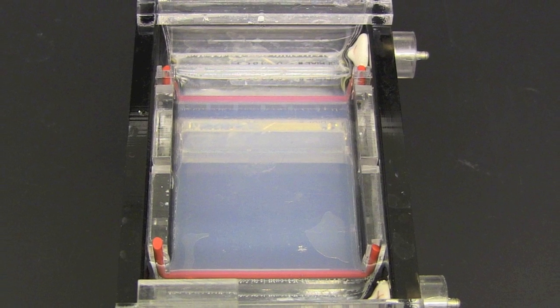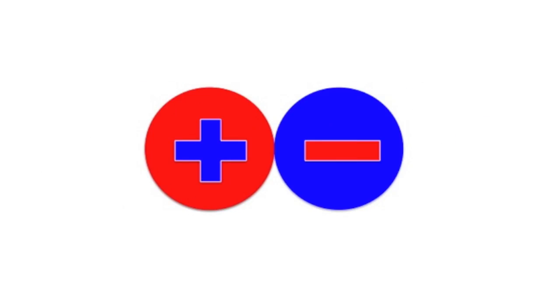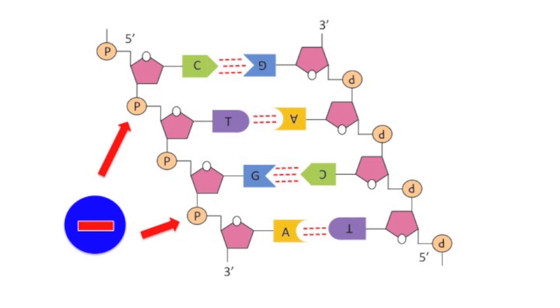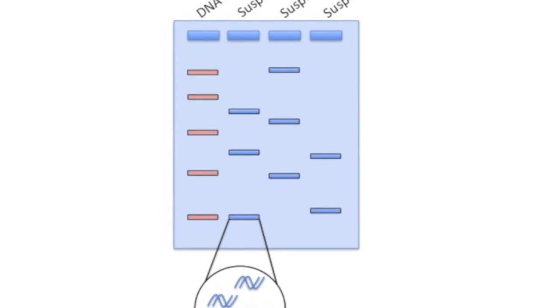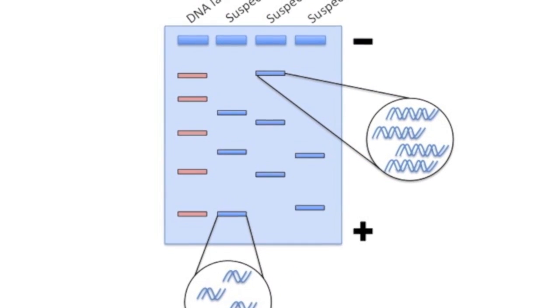Here we have a gel and the gel box. The gel has a row of wells on one end where we will put the DNA samples. But how does the DNA separate? As we all learned when we were younger, opposite charges are attracted to each other. Using this principle, DNA, which is negatively charged due to the negative phosphate groups in the backbone, will be attracted towards the positive end of the box when the current runs through it. When the current is running, the DNA will separate through the gel with the smaller fragments moving faster than the larger ones, and thus moving further down the gel.